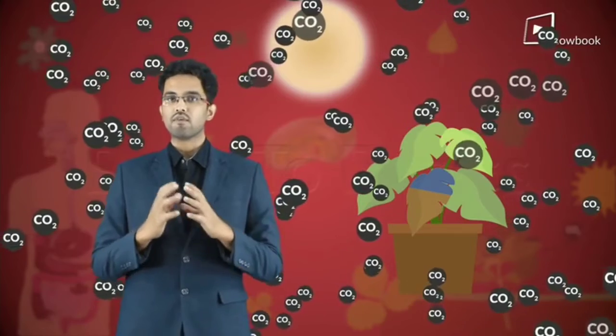After that, take some iodine solution and drop a few drops on one of the leaves outside and some on the leaf inside the bottle. You will notice that the outside leaf turns bluish black in color while the one inside the bottle turns brown. So, this clearly proves the importance of carbon dioxide in the process of photosynthesis, as bluish black indicates that starch has been formed while brown color indicates the lack of starch.